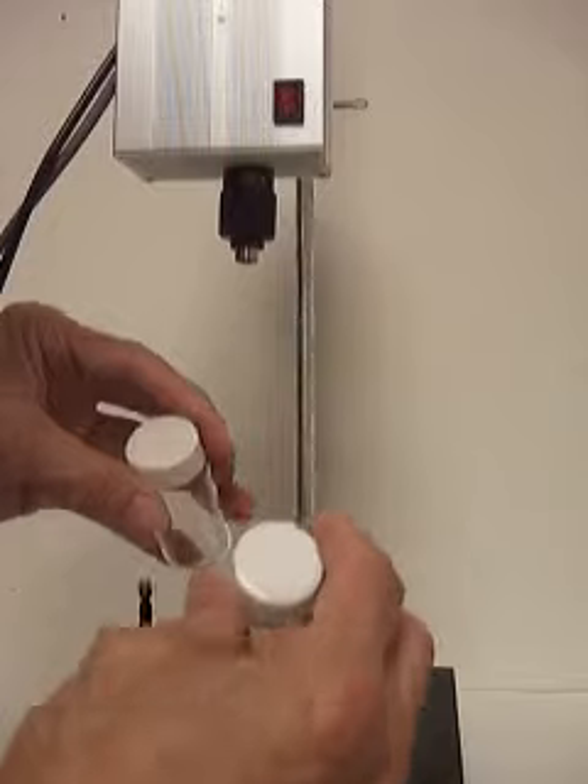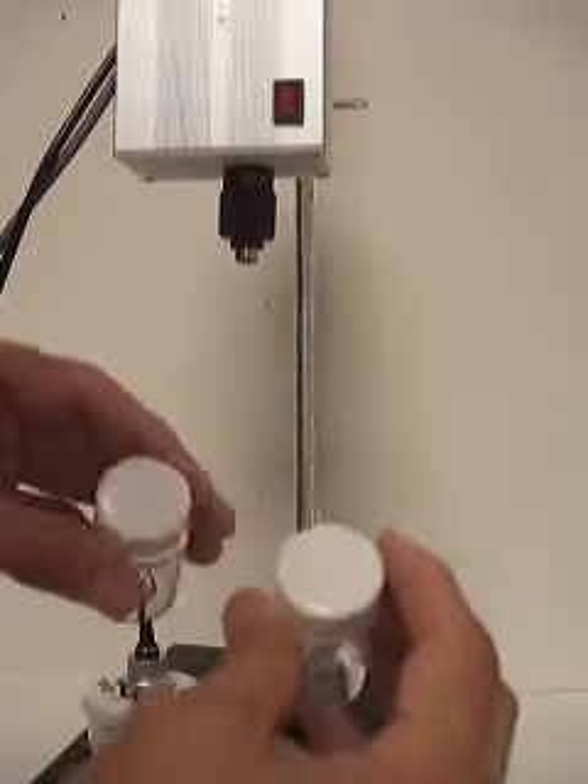It looks slightly different — these are scintillation vials. First, attach this attachment without using a tool.